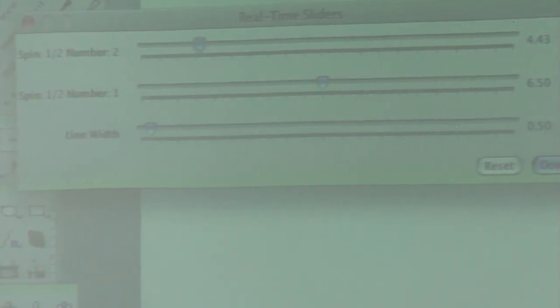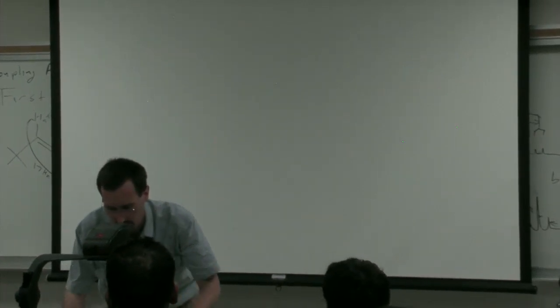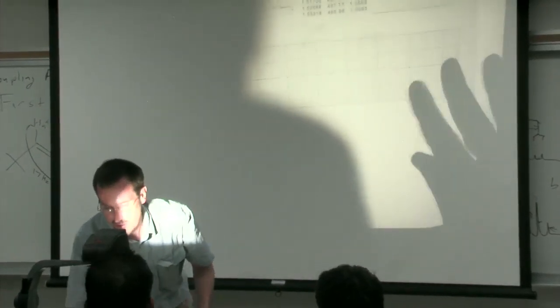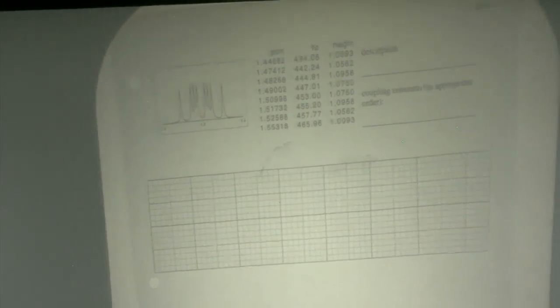All right, last thing I want to show you, as this will prepare you to tackle just about anything, is this pattern over here. Here we have three distinct coupling constants.